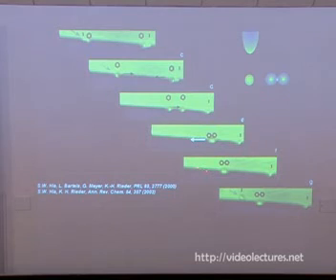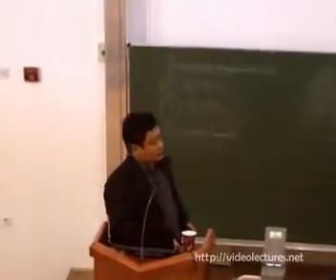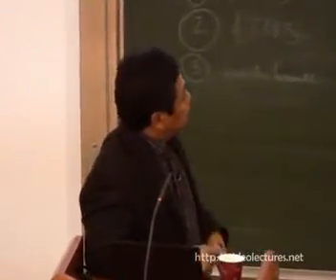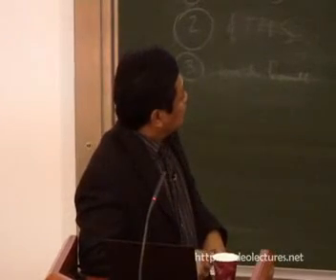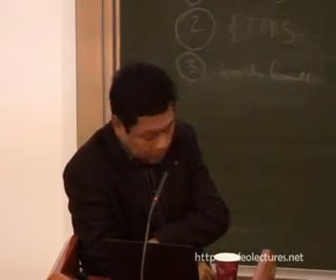So we call this engineering of a single molecule. We can synthesize one molecule at a time. We can test the chemical reactions to see how they work and to understand them at the atomic scale. This is just a demonstration. This was the old work published in 2000 in PRL, before I moved to Ohio University.